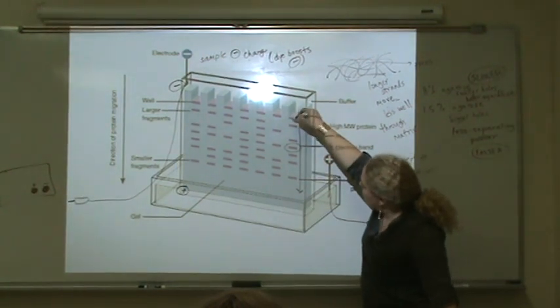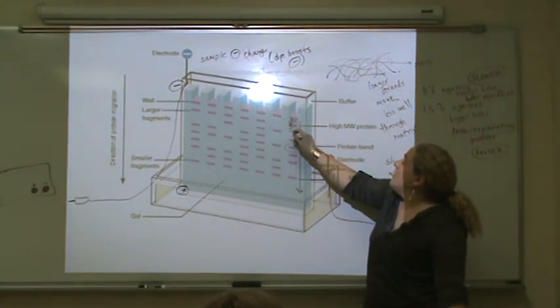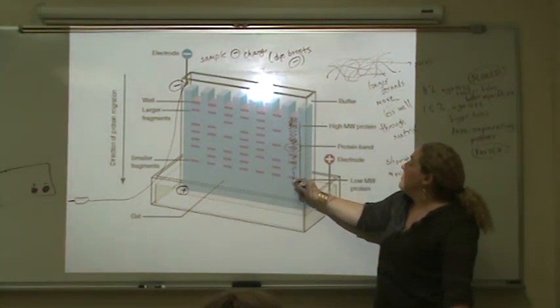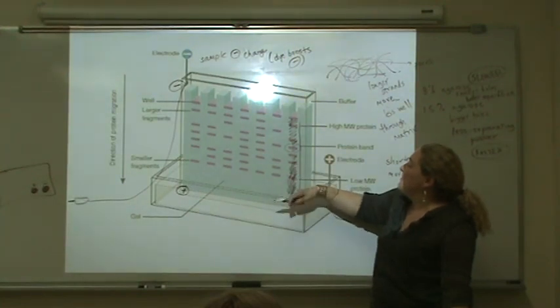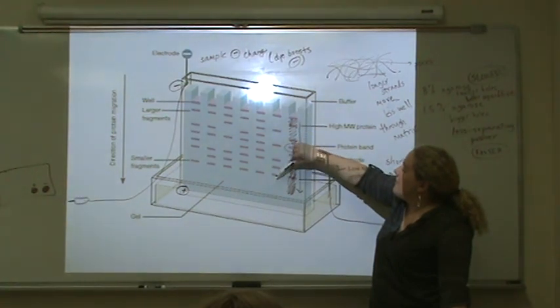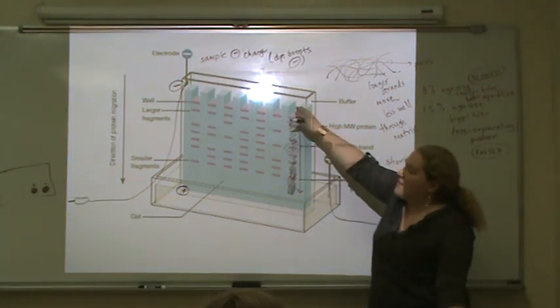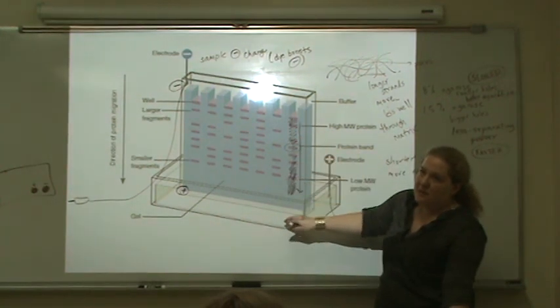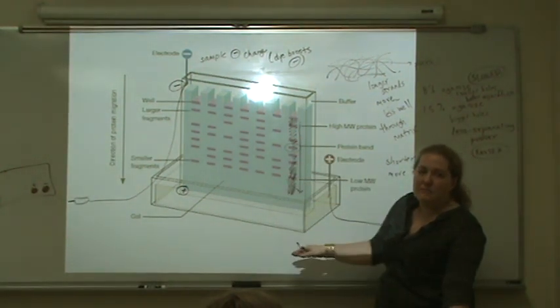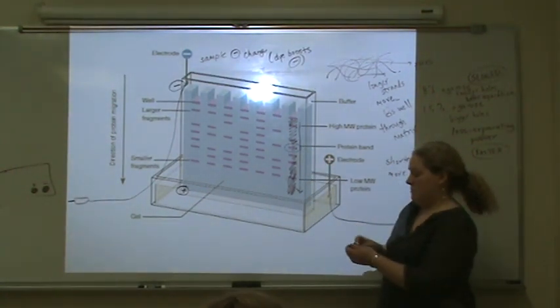And really what happens is if you're putting total protein in here, you got 18,000 kinds of protein. They're forming a column, or actually a solid stacked up stack all through this. And you don't see them so much. They're clear. But they're separated by size.